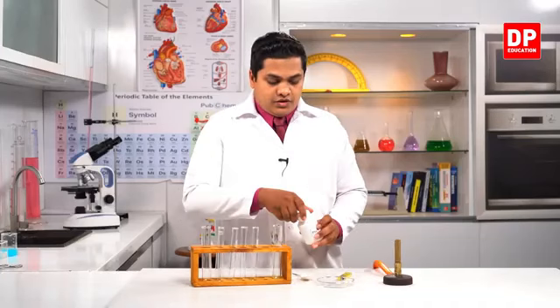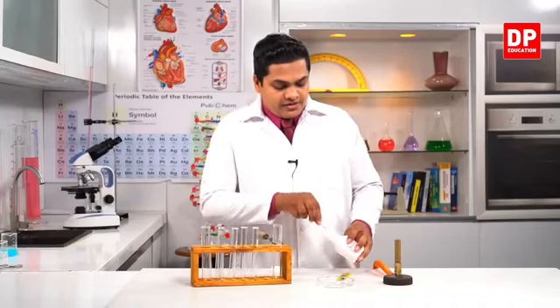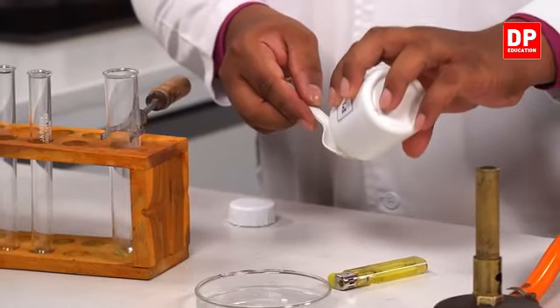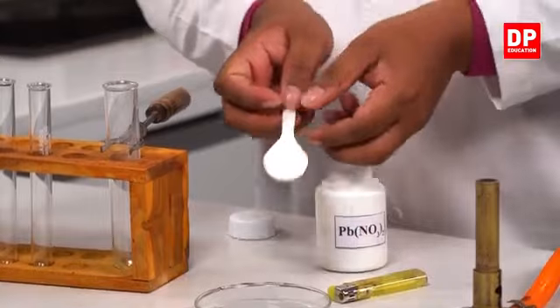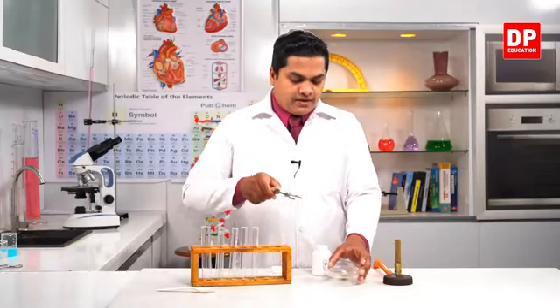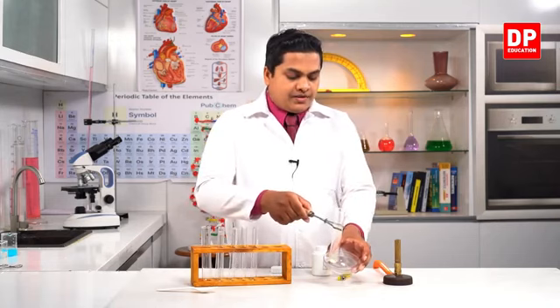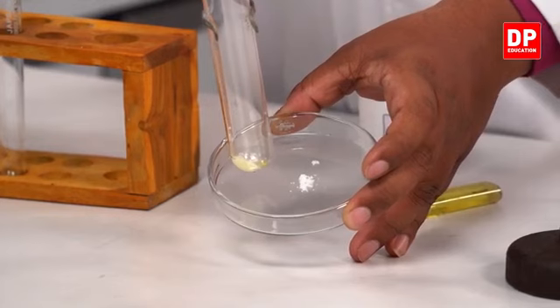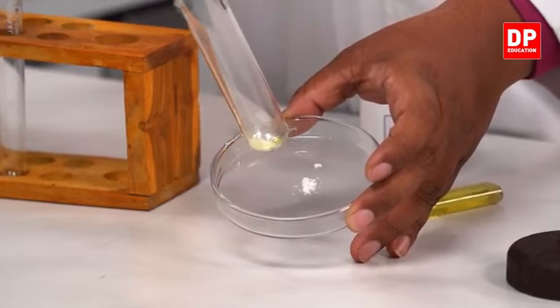Now I'll use some lead nitrate by using this. So here, check the color of these two. See, it has changed to a yellow color substance.